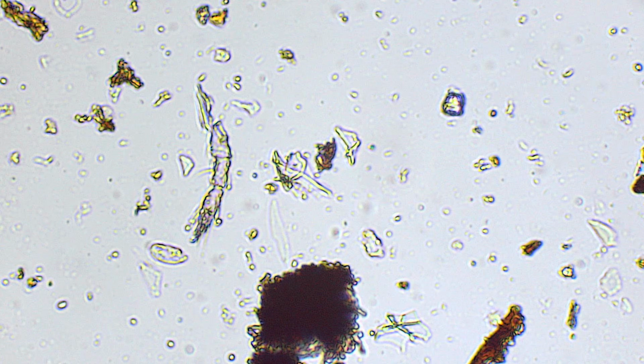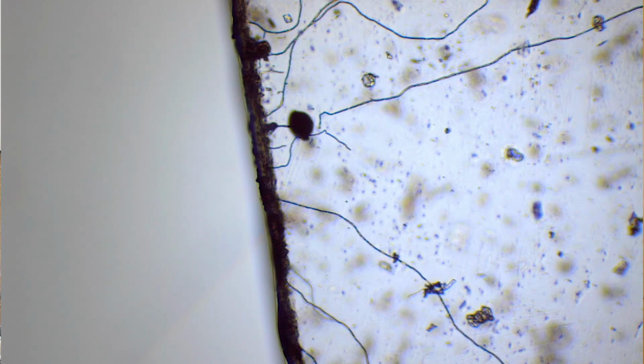In addition to microbes and minerals, you may see things like plant material, segments of insects, air bubbles, cracks in your slide, or countless other things. You never know what will come up on the microscope. And if you have questions about your findings, we recommend reaching out to fellow microscopy enthusiasts for a second opinion.